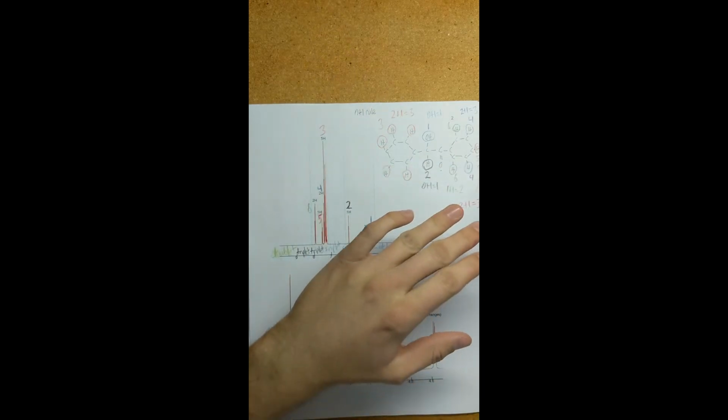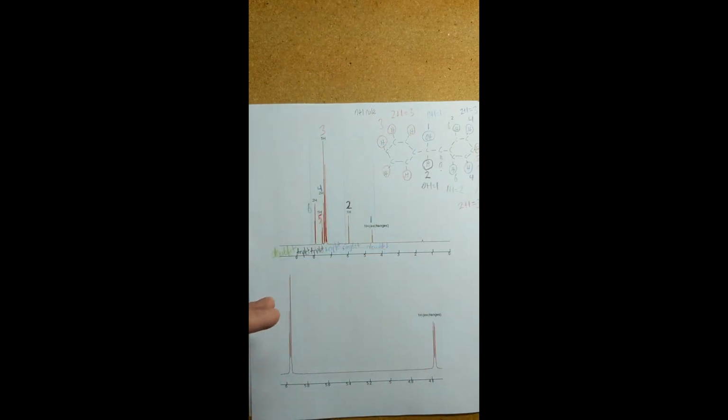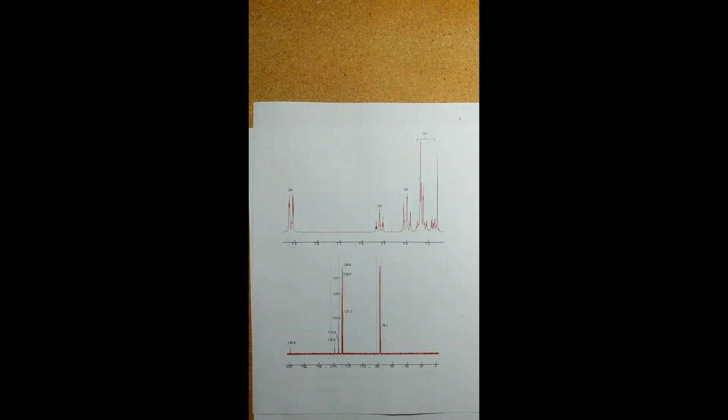And that same rule applies for the rest. If we look through, as well as how the peaks are labeled and our integration, they match up well for where our deshielding of the proton or the proton groups have been labeled. Now that proton NMR has been tackled, we're going to move on to the final step of carbon NMR.